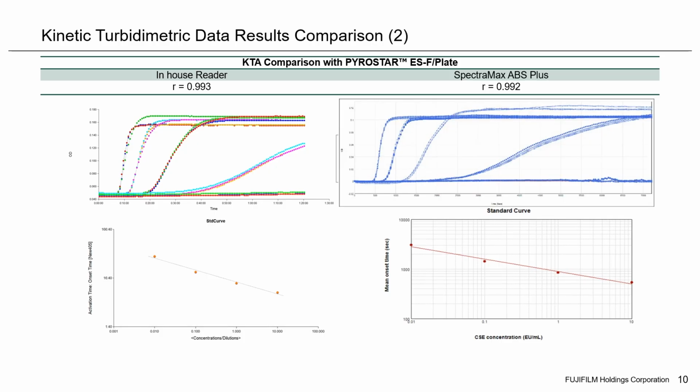First of all, I want to mention the fact that the linear regressions for the two are very, very good, nearly identical. So we have nearly identical correlation, and of course, over time, the averages, we'd see no difference between these.